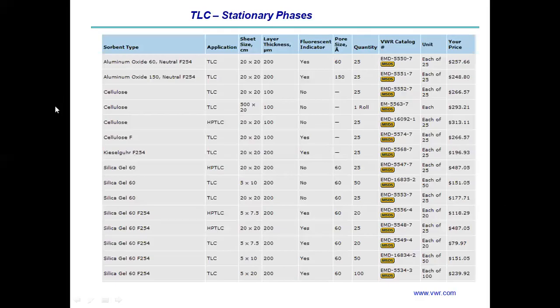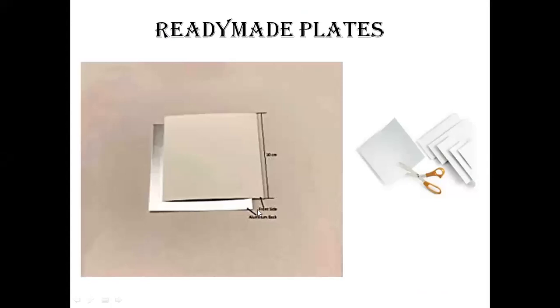Can you see it now? Yes, sir. Okay. So that is a list of different types of stationary materials which are used in TLC. ओके. ह्याच्या पुढे जाऊया आपण. हे सगळं वाचण्यामध्ये काही मला एवढं महत्वाचं वाटत नाहीये. ओके. आणि मग मी तुम्हाला केव्हा तरी बोललो होतो की रेडीमेड प्लेट्स पण अवेलेबल असतात. So this is an example. This is an actual photograph of TLC plates which are available in the market. तुम्हाला दुकानामध्ये जाऊन हे मिळू शकतं. ओके. कुठल्या दुकानात मिळेल हे ऋषिकेश?